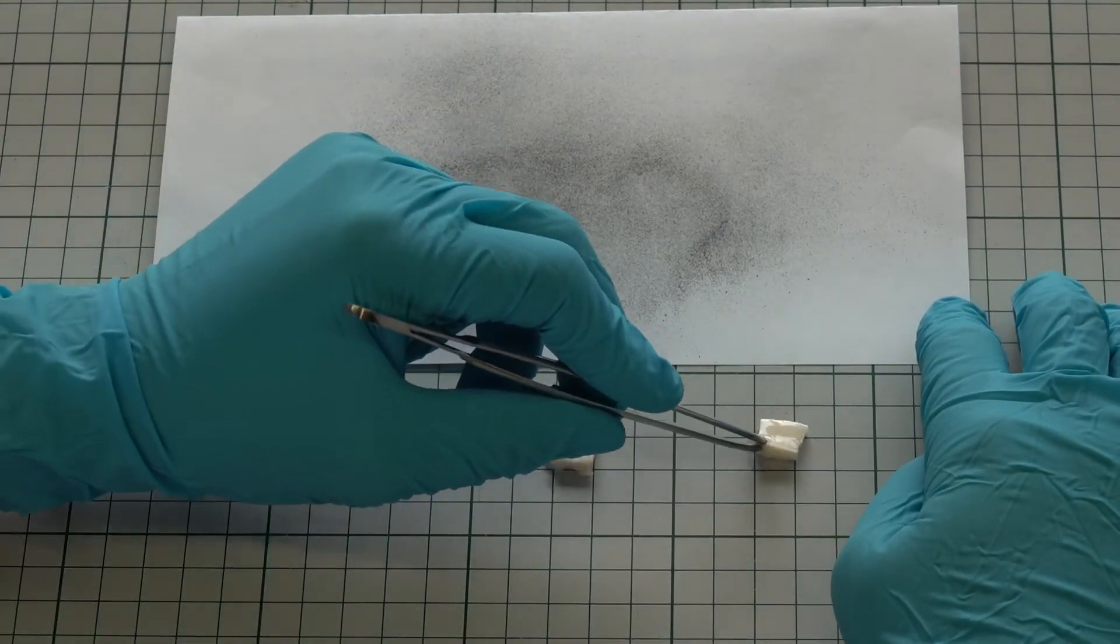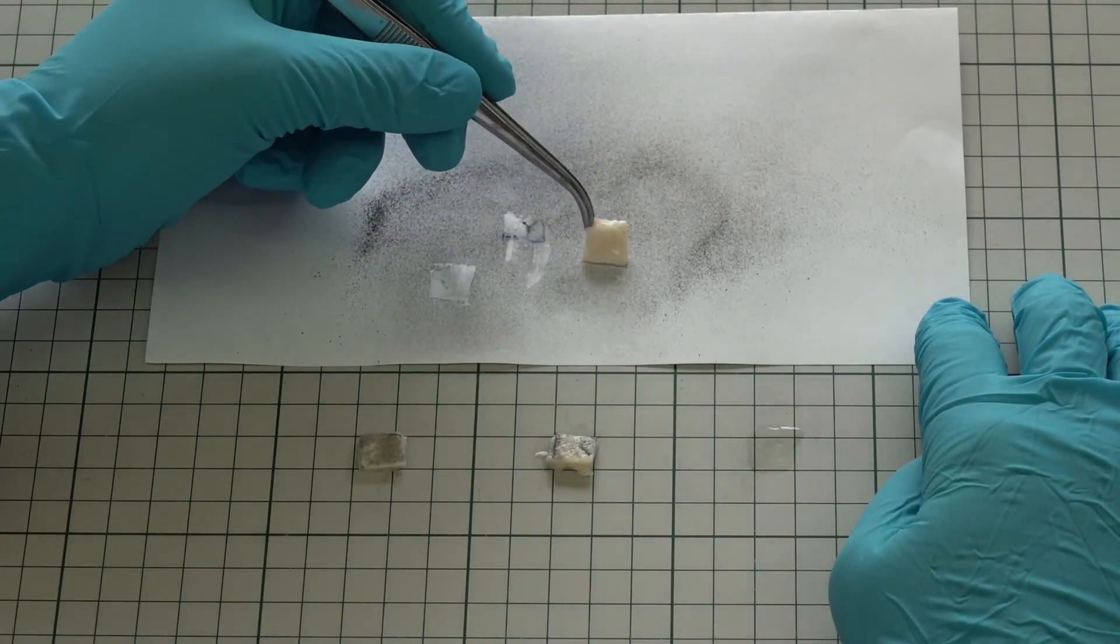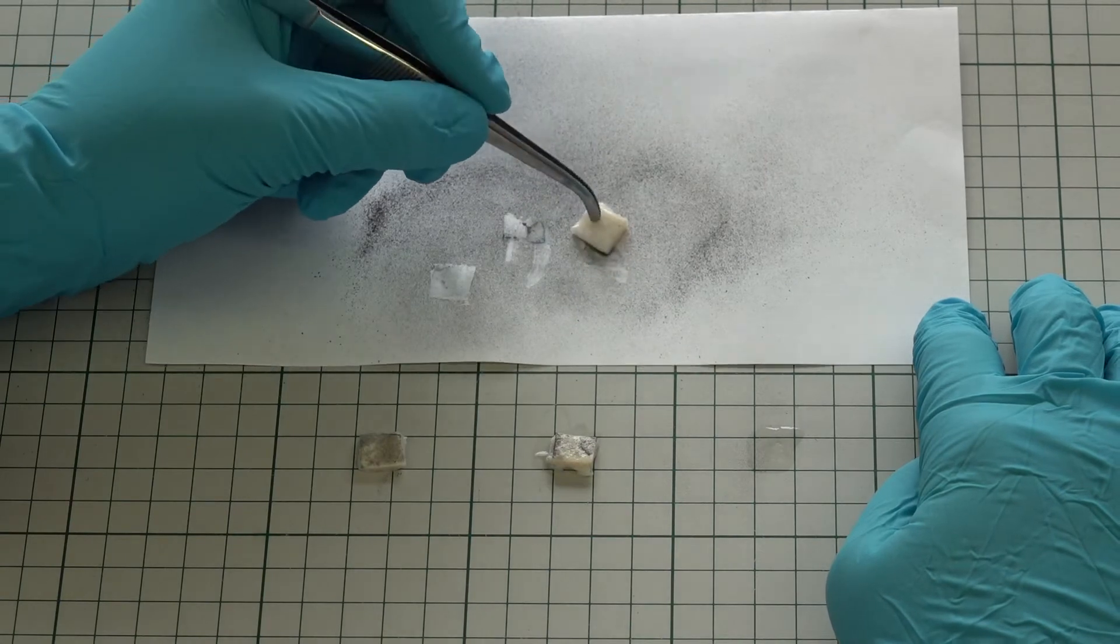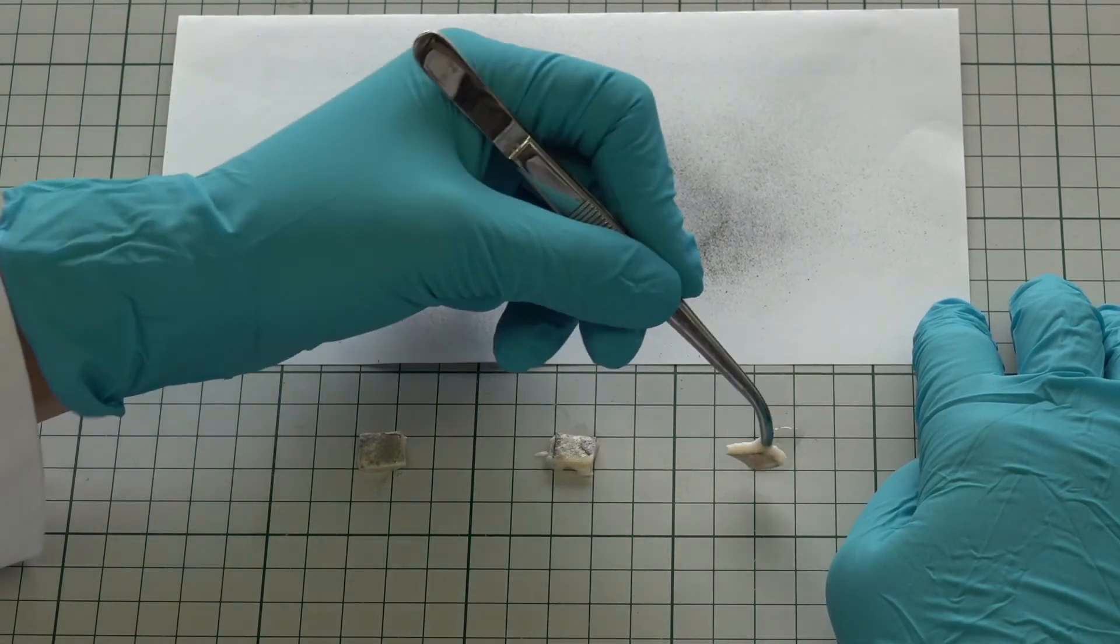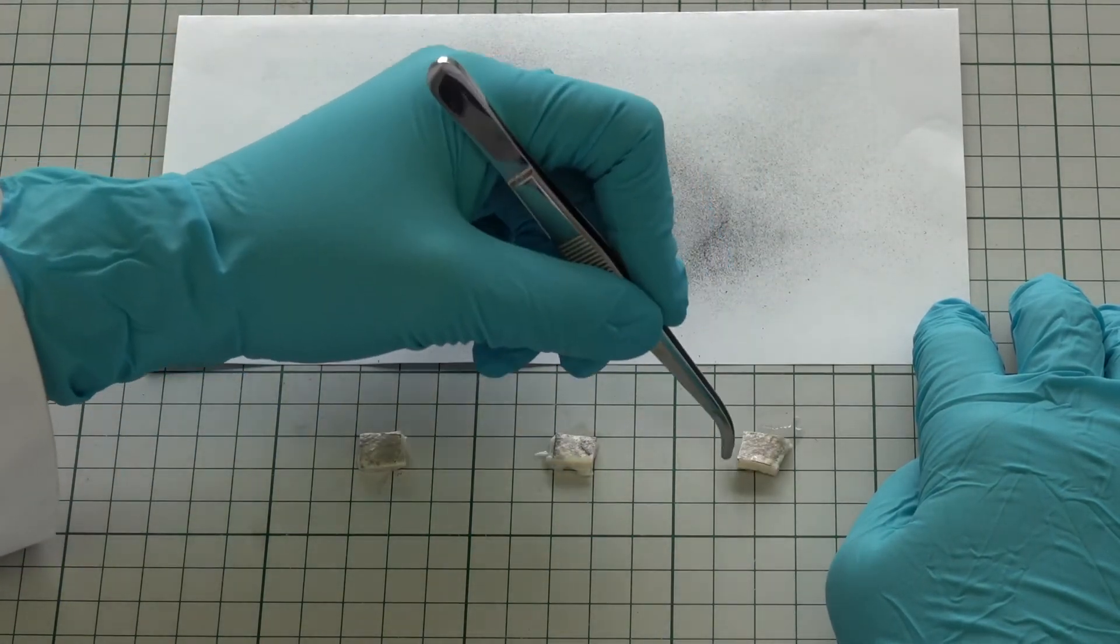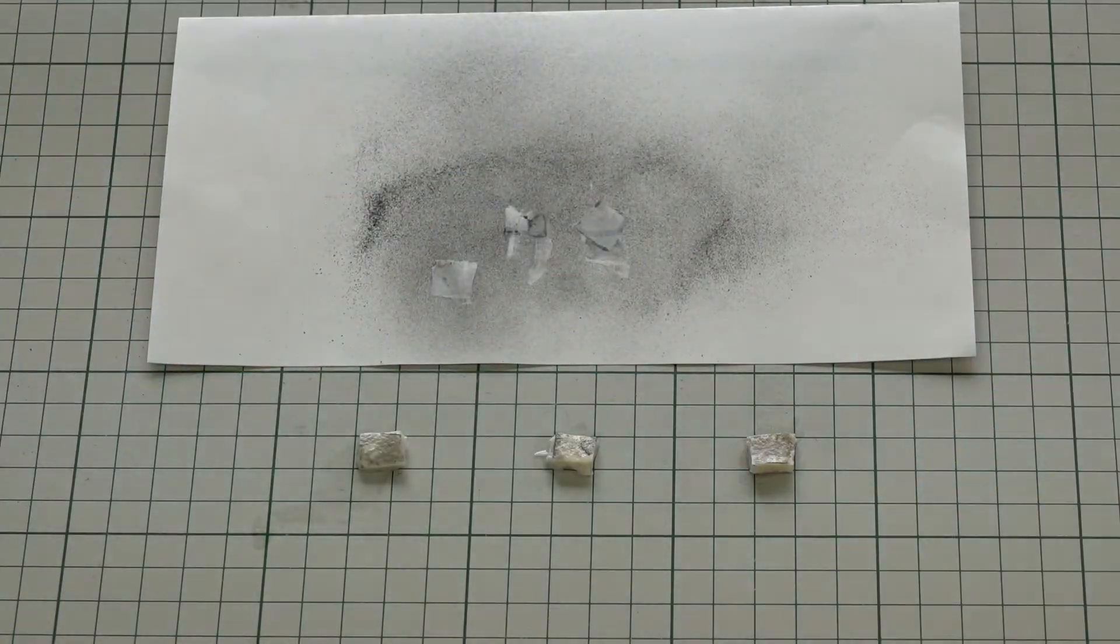Next, a speckle pattern is applied on the top surface of the sample, in this case the luminal side, by using graphite powder.